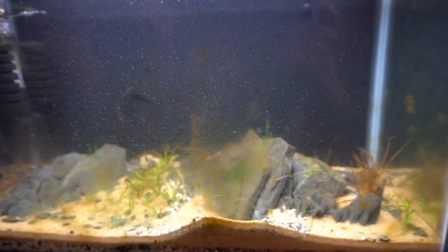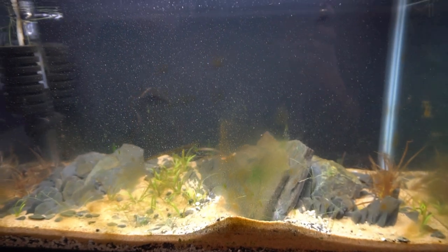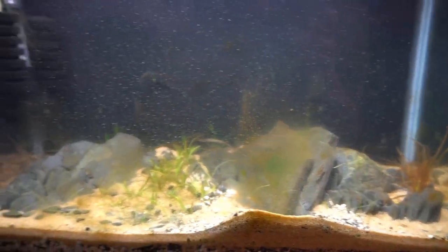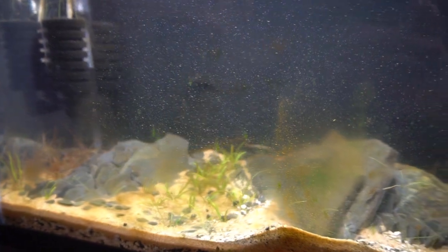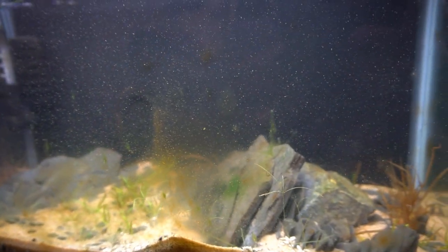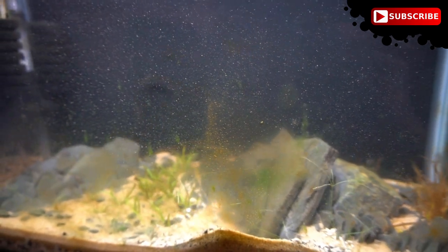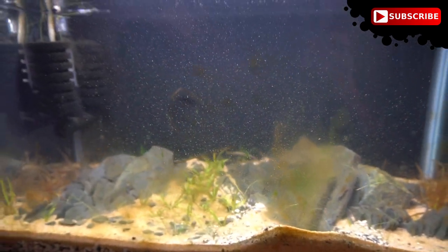I really wanna see what's on the glass of this aquarium. You can see that there's some little white stuff. Those are probably little infusoria microorganisms. And then that brown stuff, the little splotches of brown stuff around the tank on the glass, that's diatoms. Those are single-celled organisms, more like a plankton, and they do convert photosynthesis.